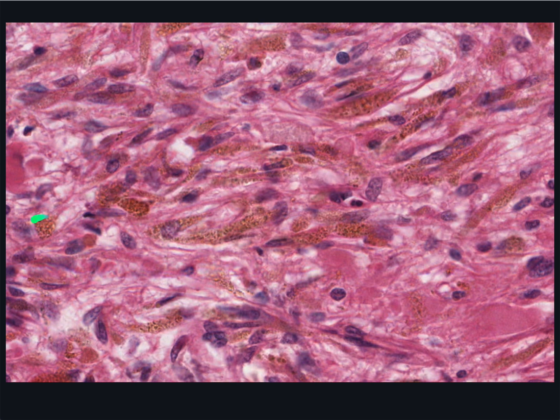Each packet represents the granule-filled end of an axon sitting next to a capillary, which may not be seen in this section as often the capillaries will collapse during tissue preparation. Herring bodies tend to be clustered together. What you might like to do as a useful learning exercise is to recall what hormone or hormones these granules may contain.